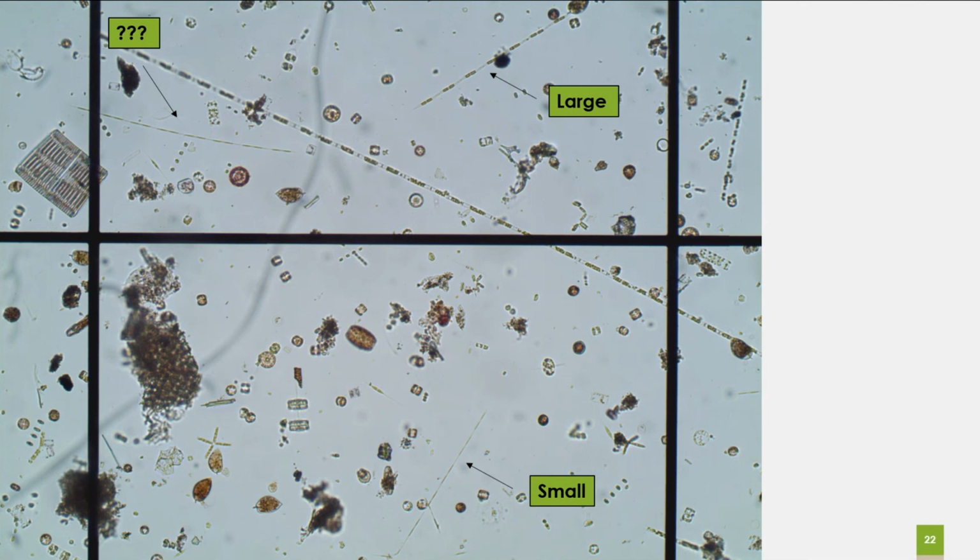But, this is a lot. Just looking at this, I can tell this is a large cell. This is clearly a small cell. And you got this one over here where I would probably measure it. Looks like it could be small. I don't know. I've done this a lot, so I kind of know. But upon your first time doing it, you definitely want to use that reticle to your advantage.